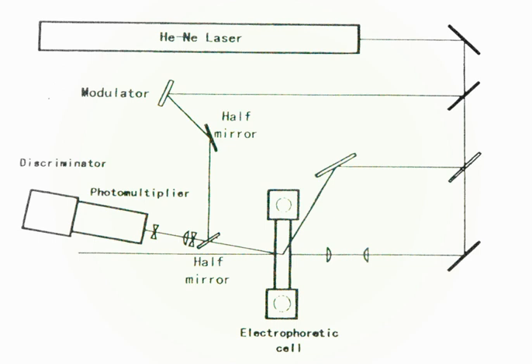The frequency shift caused only by the electrophoresis of particles is equal to the apparent mobility at the stationary layer. The velocity of the electrophoretic migration thus obtained is proportional to the electric field as shown in Fig. 7. The frequency shift increases with increase of the scattering angle as shown in Fig. 8. This result is in agreement with the theoretical EQ 7.